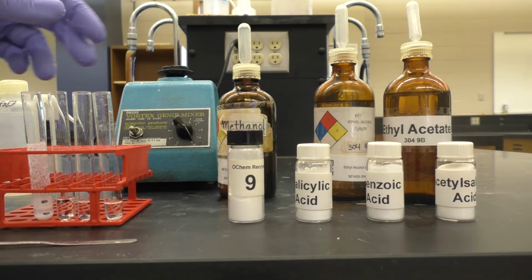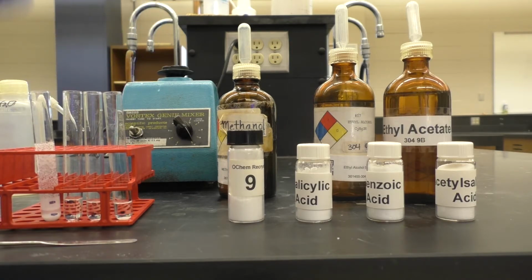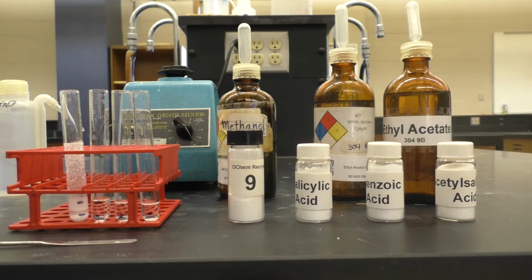However, in the cases where compounds mostly dissolve at room temperature, then that's not necessary. That's not a good one to do. If we had two that were pretty much completely insoluble at room temperature, then we would test them both at elevated temperature.